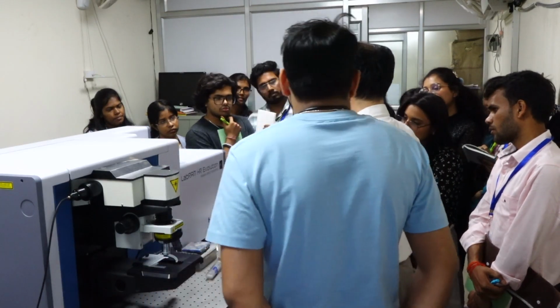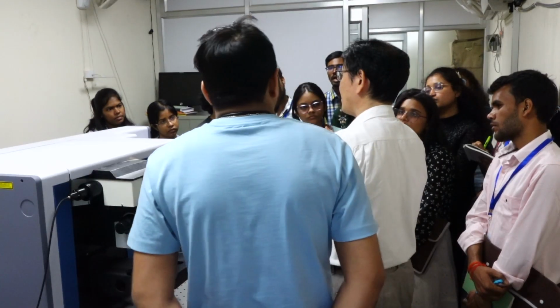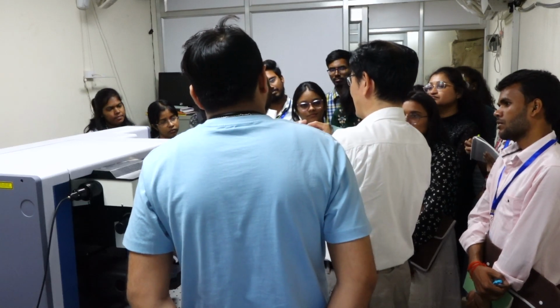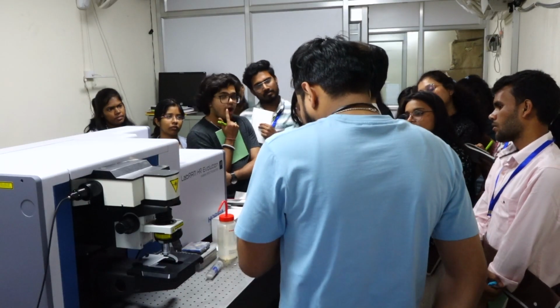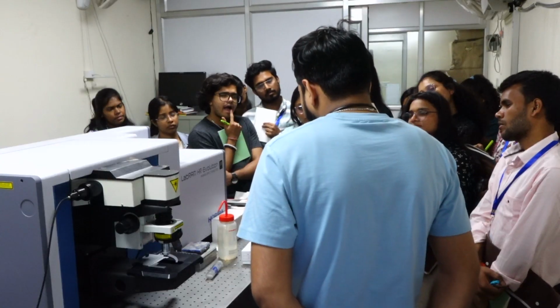If this is a protein sample, say 1 milligram for $100 or something, then such a volume is very difficult to prepare. A precious sample is usually obtained in a very limited volume.